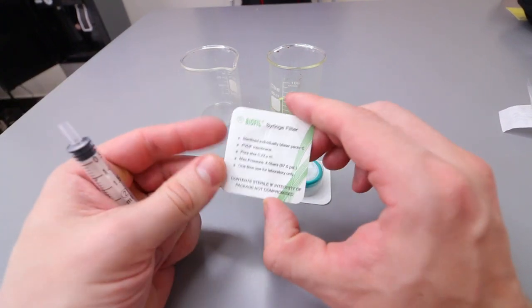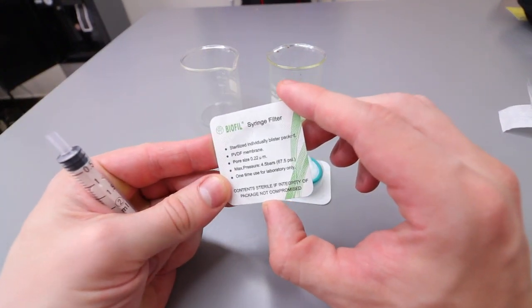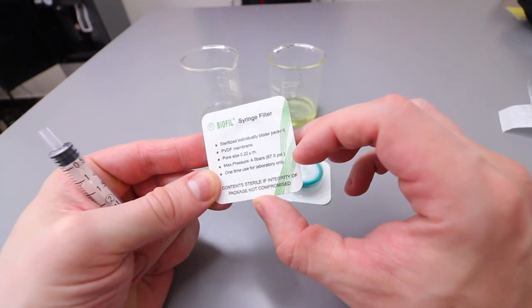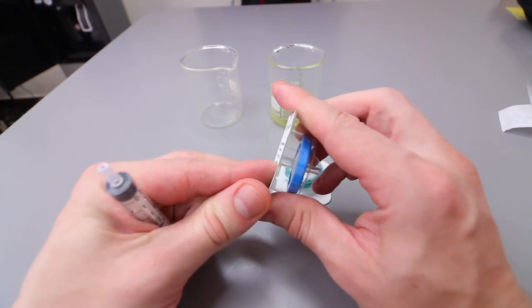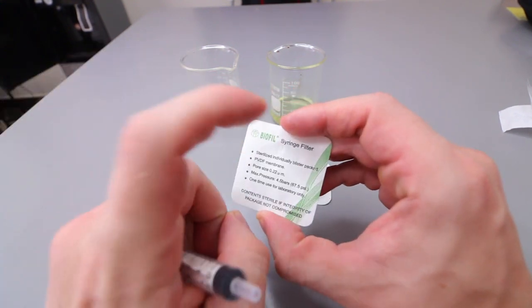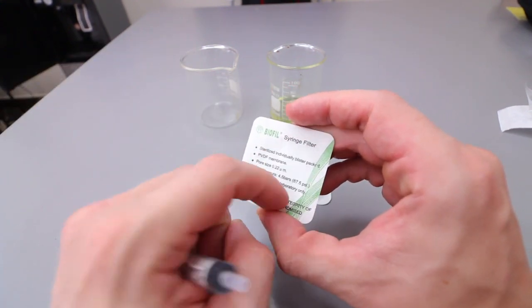So these ones are also available and if you have a look, these are rated at 67.5 PSI and that is important. It is important to actually be looking not only at the filter membrane type, which in this case we're using PVDF.